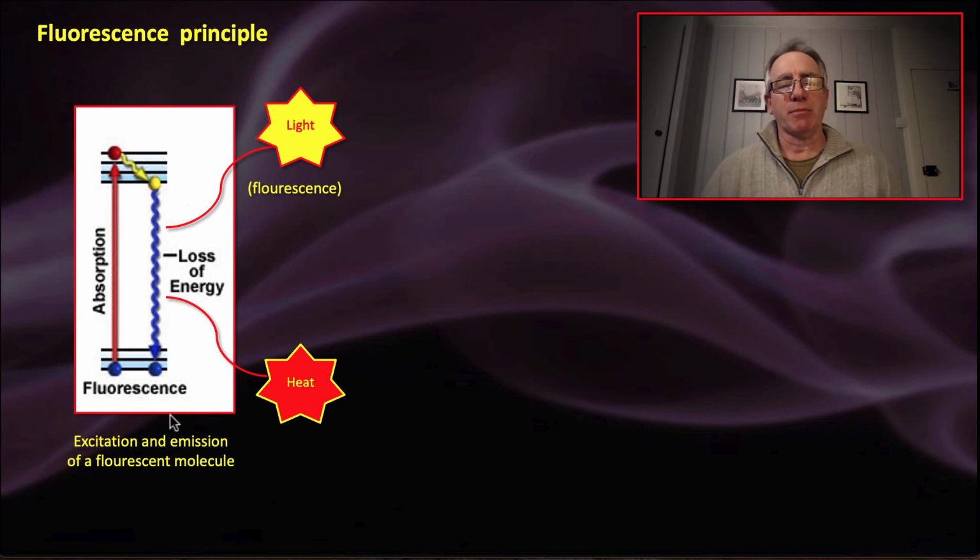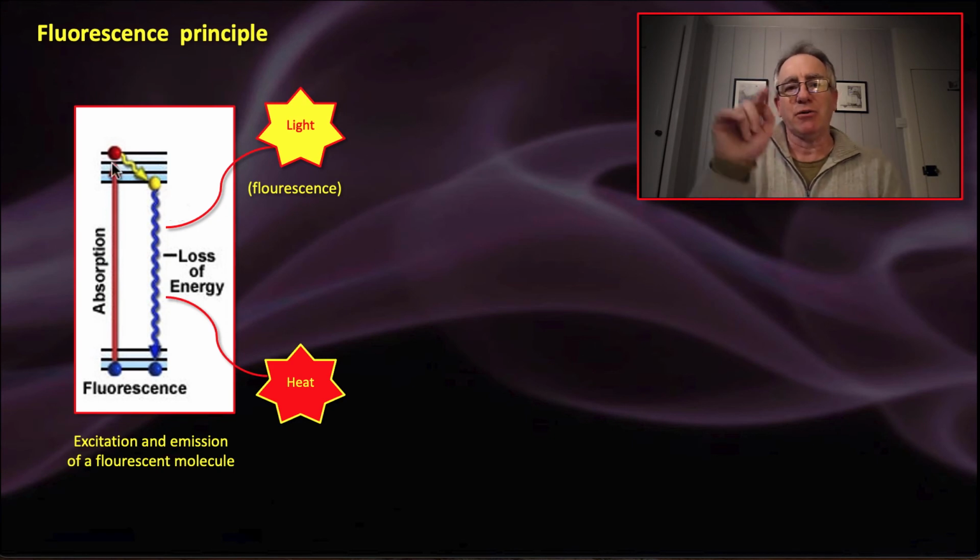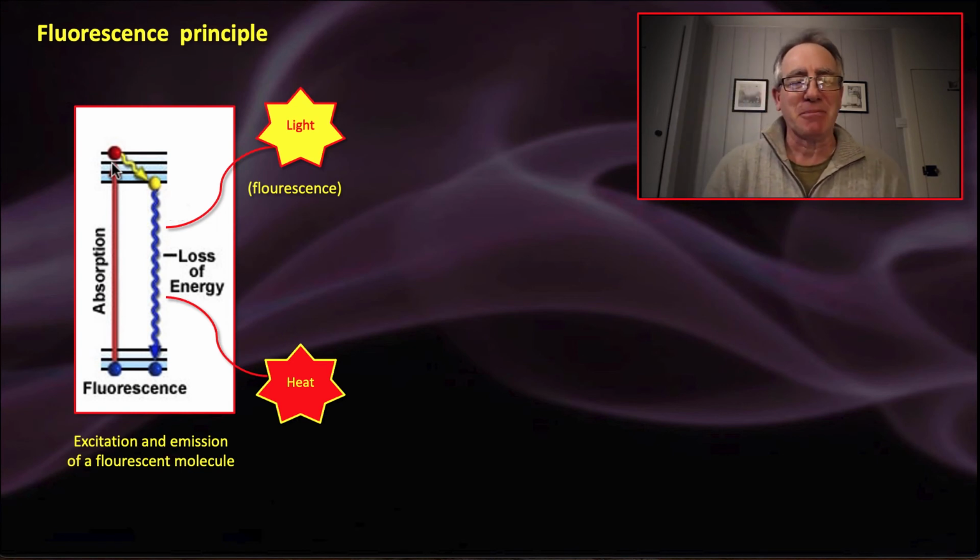All matter is made up of atoms, of course, and if you excite an atom by inputting energy into it somehow, its electrons jump from ground state, so-called. The electrons in the outer electron shell jump from ground state out to a higher orbital. I don't know if you took chemistry and remember all of the details of this. Don't worry, I'm not going to test you on it. But an input of energy will cause atoms or molecules to get excited.